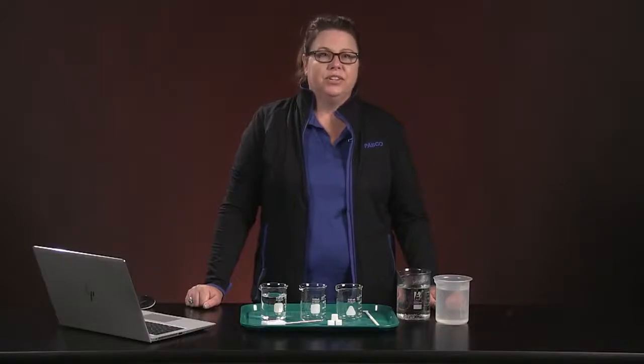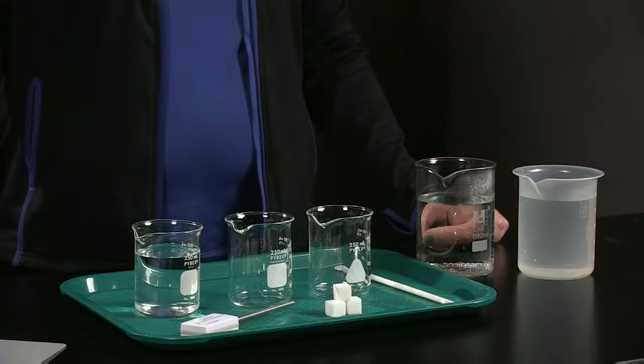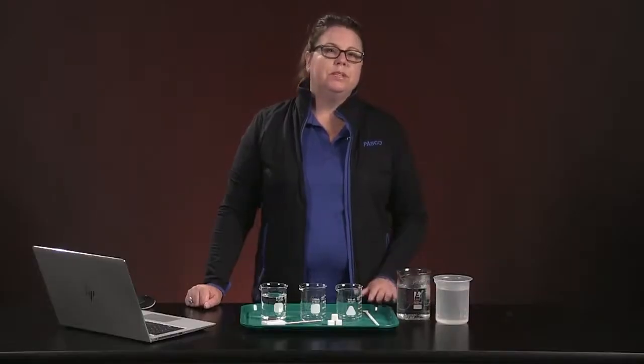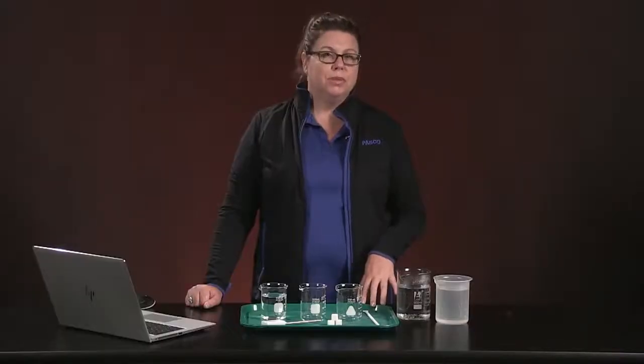For this investigation, you will need a temperature sensor, 3 250 milliliter beakers or clear cups of similar volume, a stir rod, water, and 3 sugar cubes. I like to put my setup on a large plastic tray. It makes for easy cleanup and keeps my papers from getting wet.